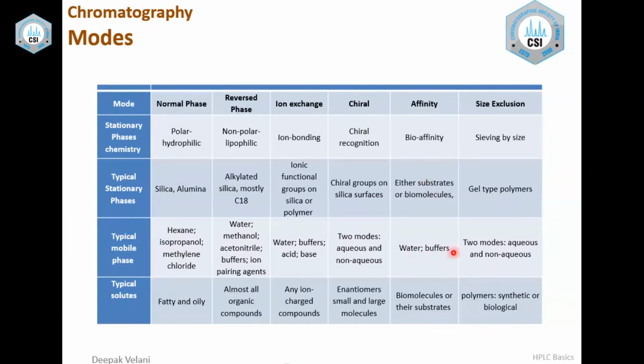Water and buffers are used in this because solvents cannot be used, as biomolecules are not stable with them. Typical solutes are biomolecules or their substrates. Size exclusion I have discussed. It's basically a column which has an appropriate pore size, because of which the compounds are separated.